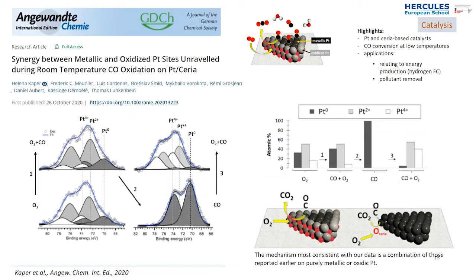Those are the two stable oxides of platinum. And in the oxygen, there you can see a combination. If you put CO in it, you have the reaction gas of oxygen and carbon monoxide. This reaction gas leads to the production of CO2.